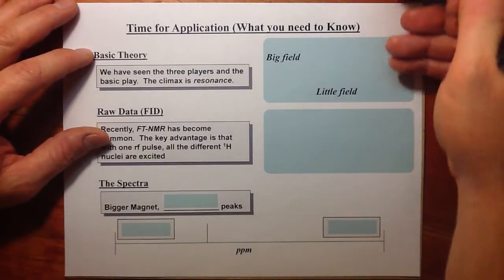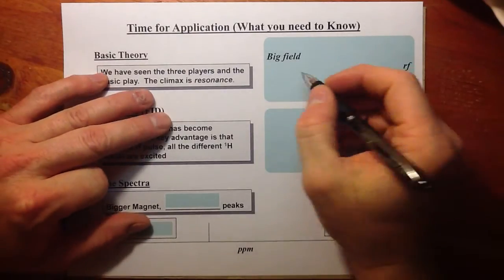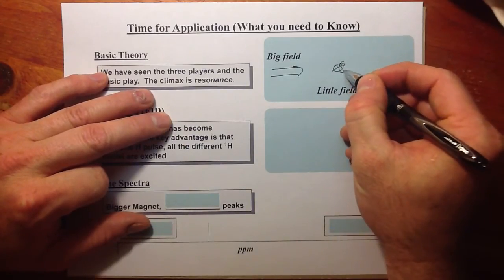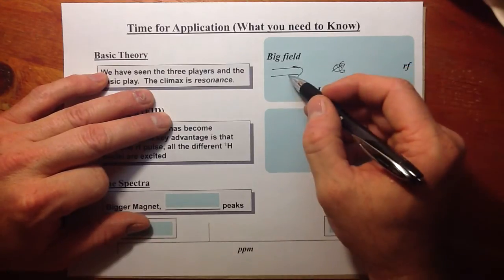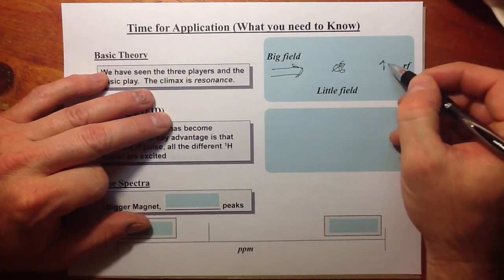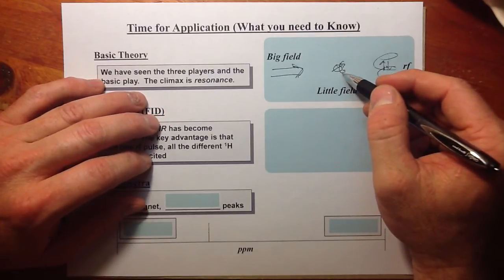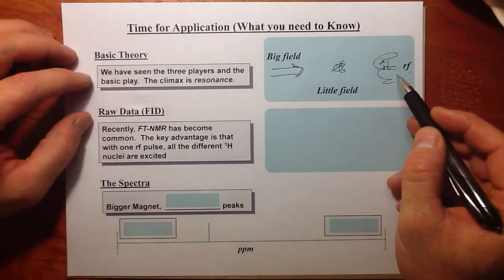So let's just kind of wrap up what we've talked about in this video. We said that we have 3 players. We said we have some big field, but we have some little field that big field can work on. And what we work on really in the application of the radio frequency is that component of the little field that's not perfectly aligned with the big field, that precession. And we matched that frequency of precession by applying a radio frequency of the same frequency as that precession frequency. So that was key, those 3 players: big field, little field, and radio frequency.